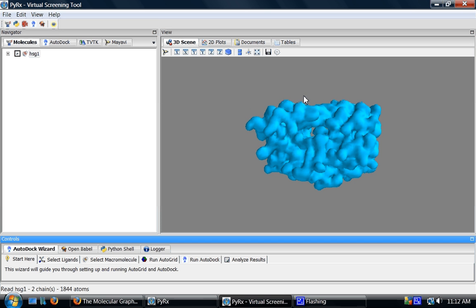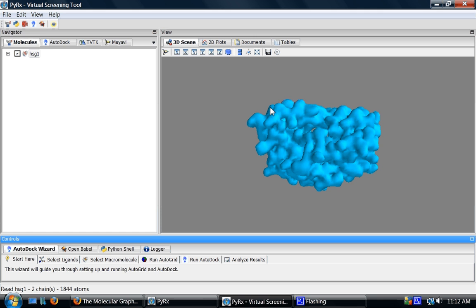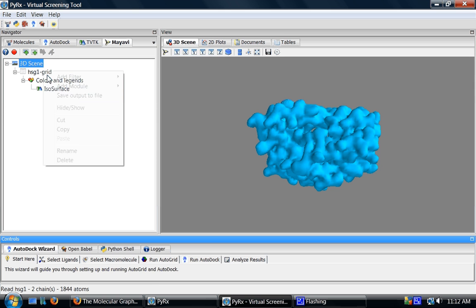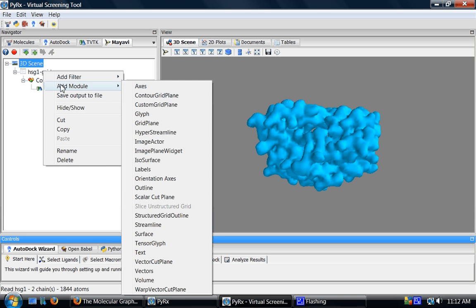To explain the algorithm behind this surface computation, I'll go to MayAVI tab. And here you'll see this grid object. I'll right click on it and choose add module and select outline.